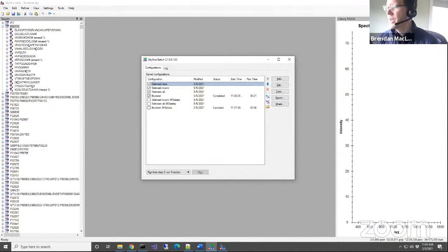What settings can you, okay, that's the one that I just answered. Is there a maximum limit in size or number of files that can be managed in Skyline with DIA? I'm working with sometimes hundreds of samples on the human DB or even bigger DB.